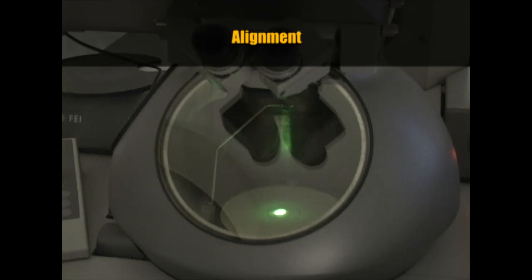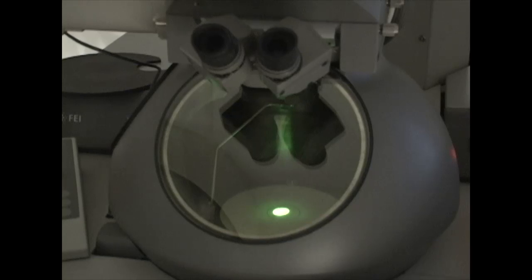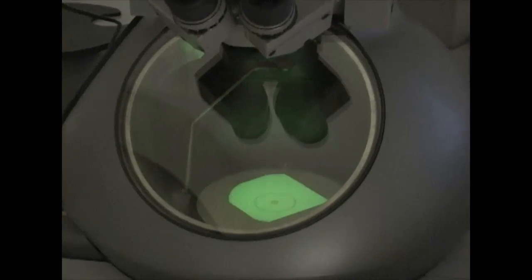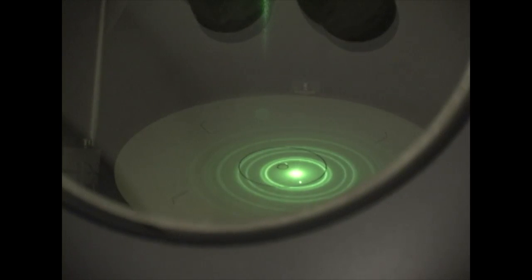Next, we will do alignment. Use the track ball to move the beam to the center, spread the beam, increase magnification, and then condense the beam. The rings are caused by diffraction.